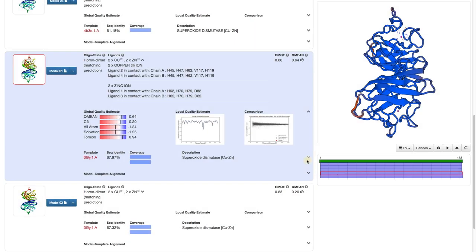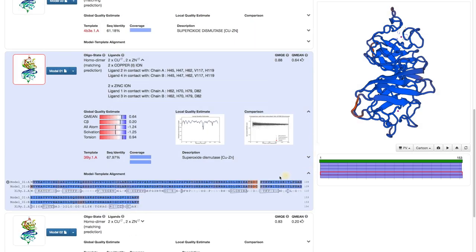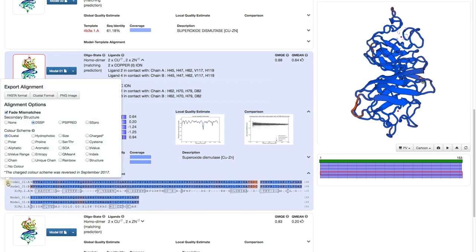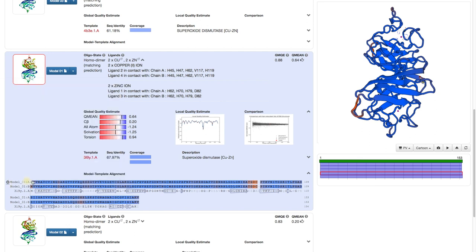If we expand the model template alignment and click on the gear icon, we see that we have a new option how to color it. If it is not yet set to Q-mean4, choose it. This colors the sequence and the structure according to the local quality estimate.